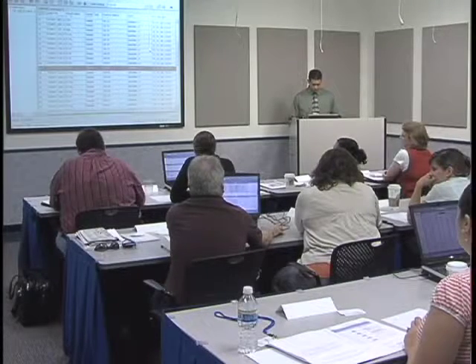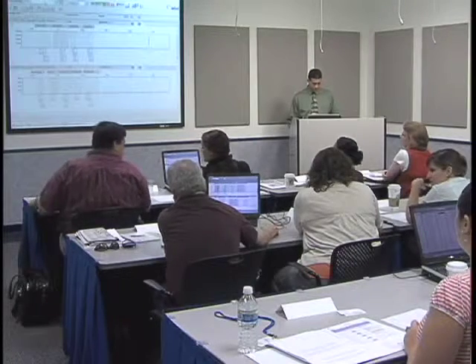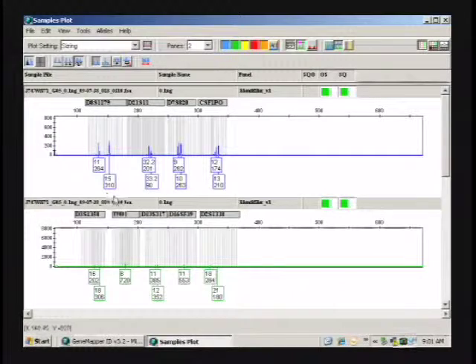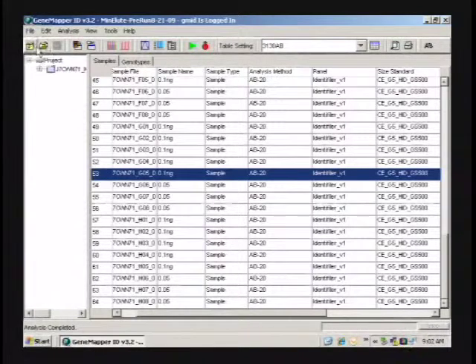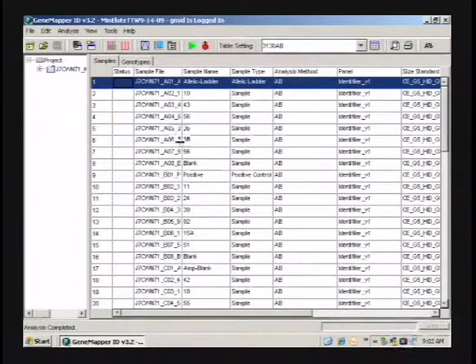Would have been sample G5. So this was the before of G5 of number 36. We could try and remember this if somebody wants to write them down, but like 200s, 300s. We have something as high as 700 on a homozygote, nearly 400 on that heterozygote. So a lot of 200s, 300s is about the average of what we're looking at. And now let's look back here at number 36.